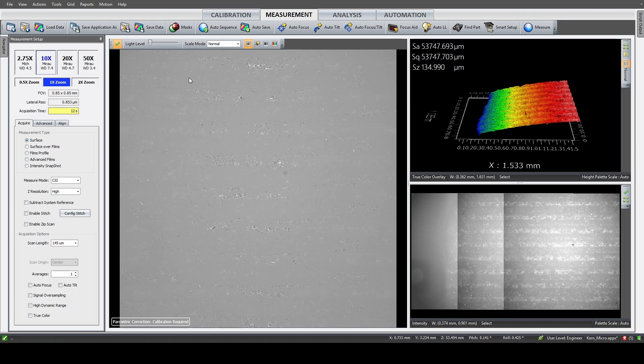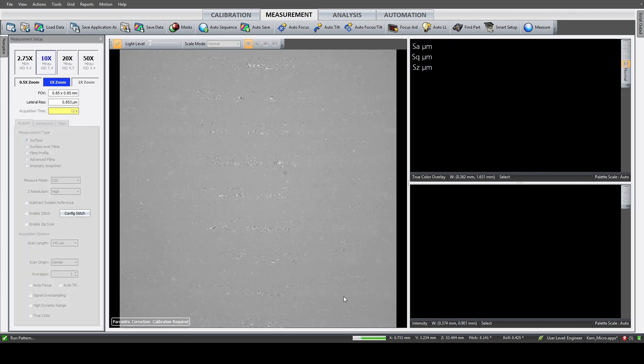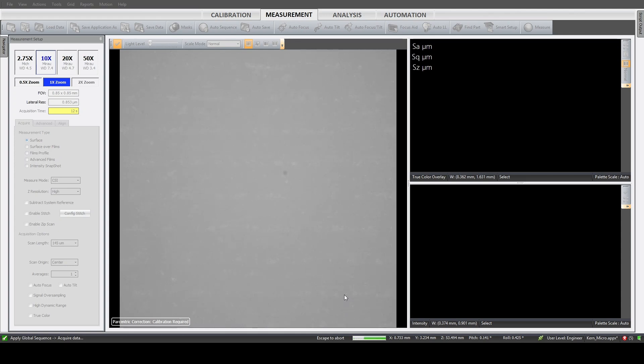And from how quickly I'm recording this voiceover, you can guess it's super fast and easy to use. After having recorded the first data set, I can see illumination is nice, data looks pretty complete. So off screen, I'm adjusting stitching parameters so we can get a bit larger area for doing metrology, but also so I can highlight some important concepts in surface roughness.